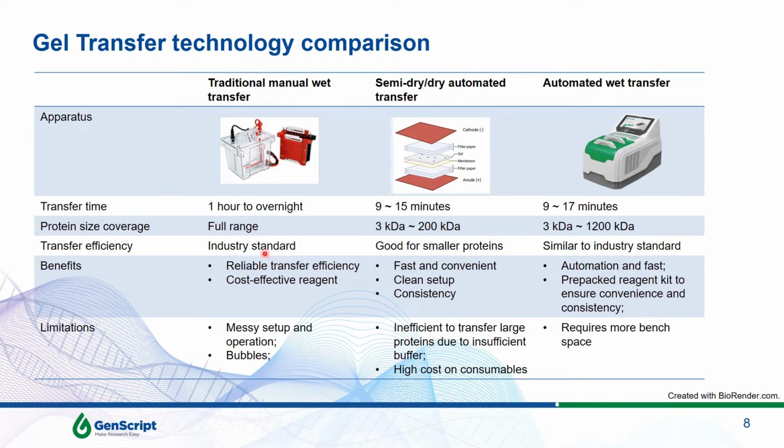The benefits of the traditional one is that it's reliable and cost efficient, but the manual operation is messy and labor consuming and sometimes has bubbles hidden between the gels and membranes, which reduce the transfer performance.